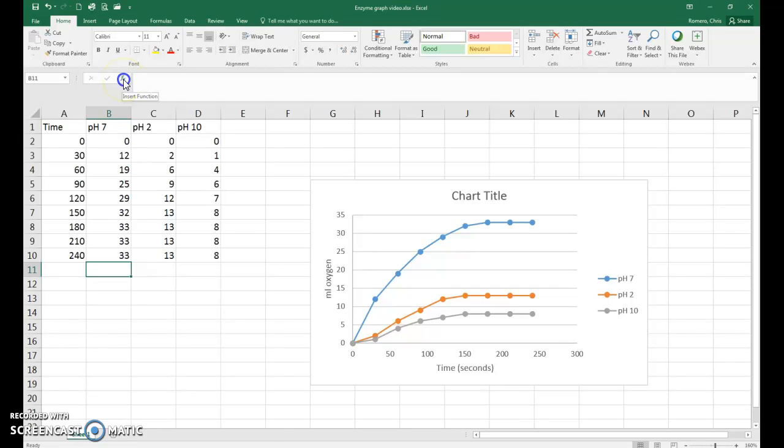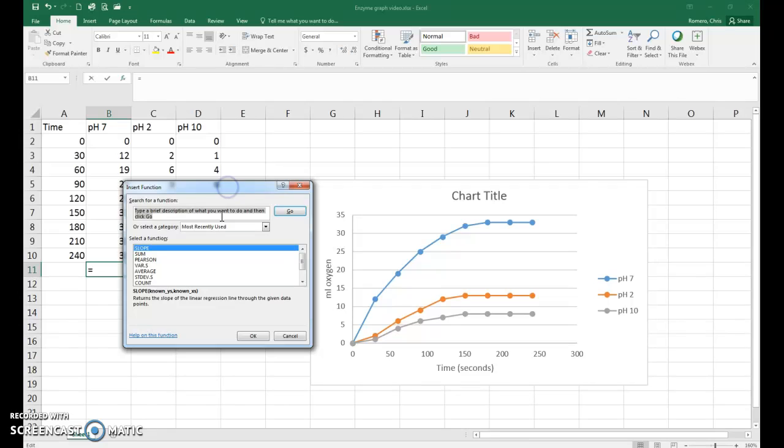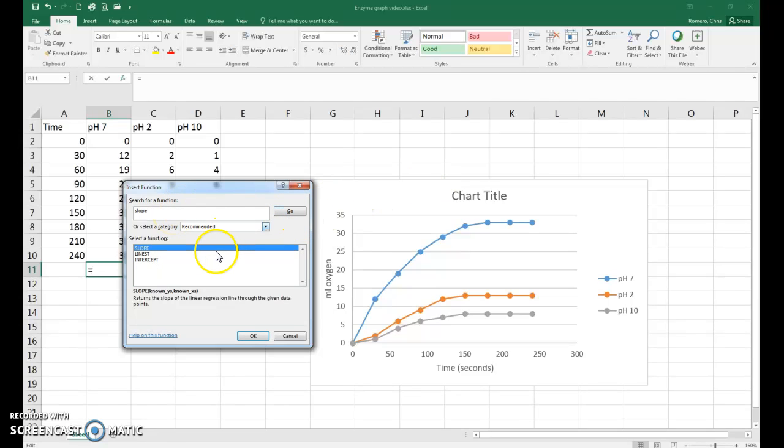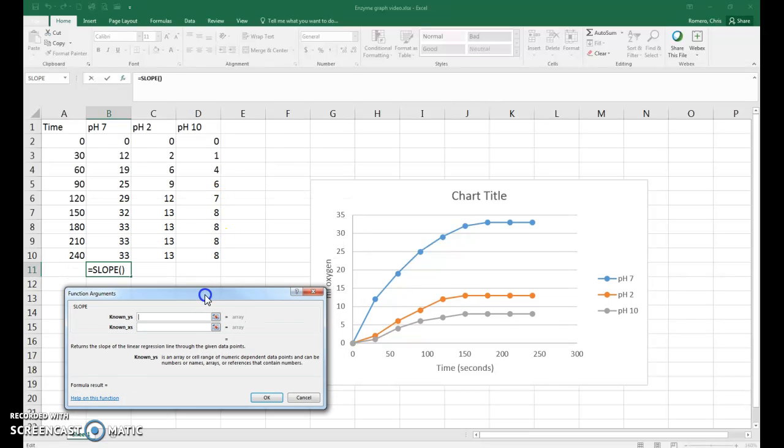Click on that and it's going to open up a window that will allow us to find the slope function. So in the search for function, you just type in slope and hit go, and it will come up in the list below. Click on OK and that will start us into the slope process.